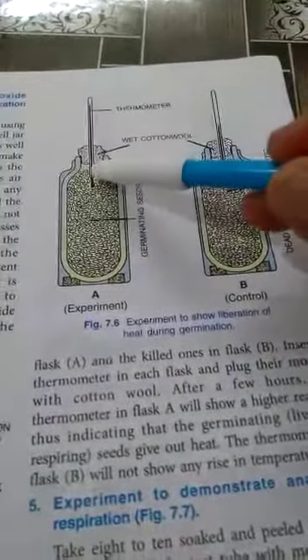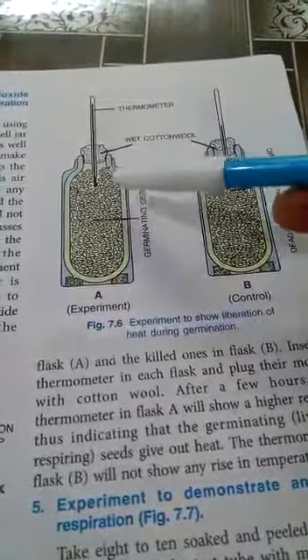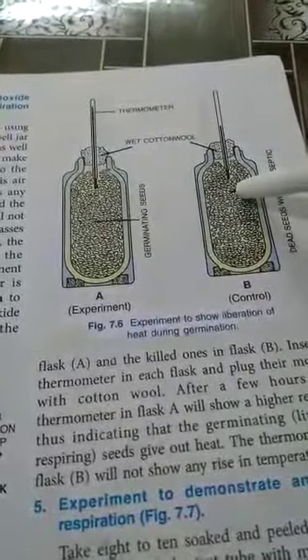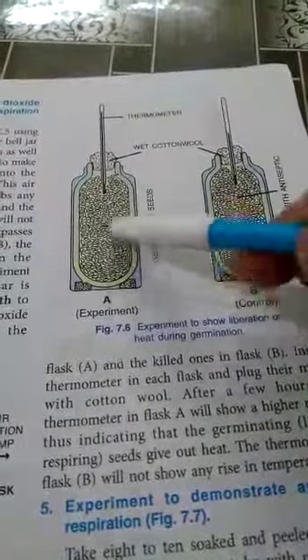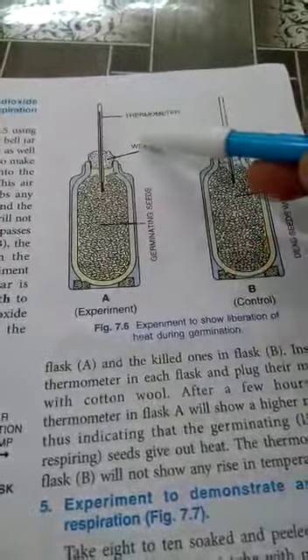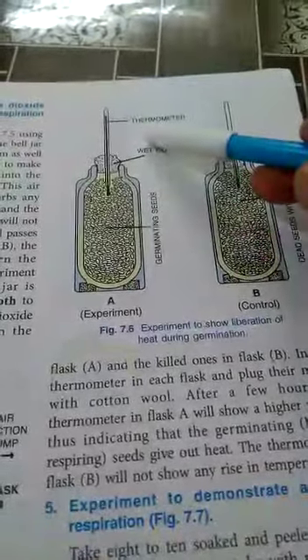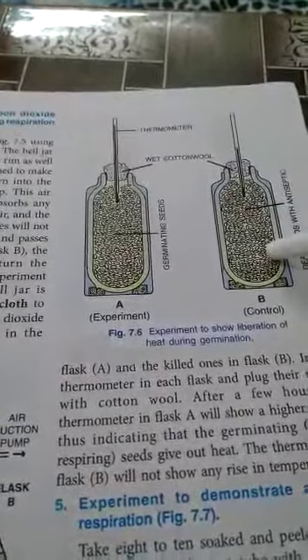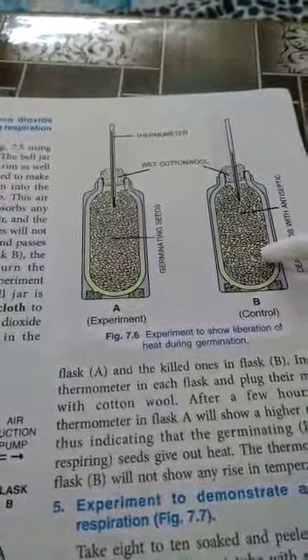After a few hours, when we observe, we will see that the temperature on the thermometer in thermoflask A will rise, while here there is no rise in temperature. This proves that these germinating seeds respire and release heat, due to which the temperature is increasing. Here we have placed dead seeds, and dead seeds do not respire. Remember, whenever we use dead seeds or boiled seeds in any experimental setup, we have to add some antiseptic like carbolic acid to prevent bacterial growth.